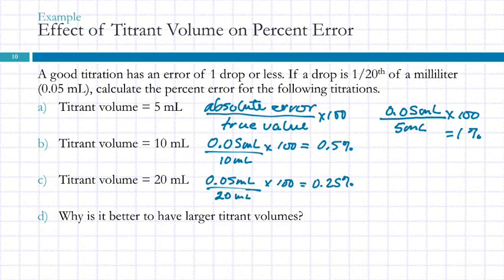Actually, no, it isn't. The previous ones were asking you to use like 12 milliliters, really just wanting to get past the 10, so at least with significant figures you'd have 4 significant figures. But if you look at it this way, it's much better to get closer to 20 milliliters.